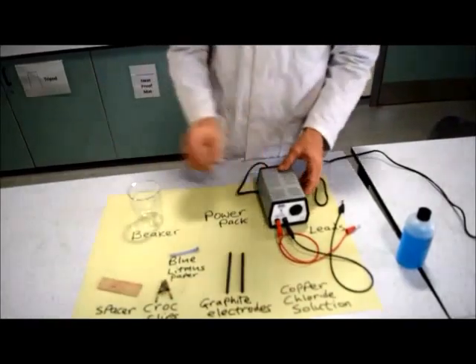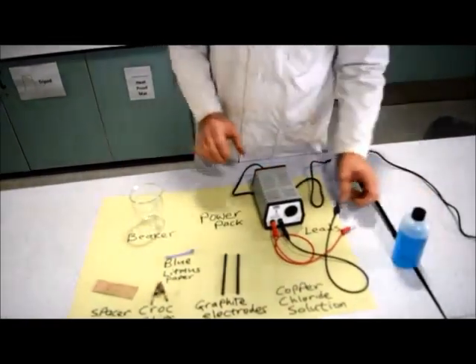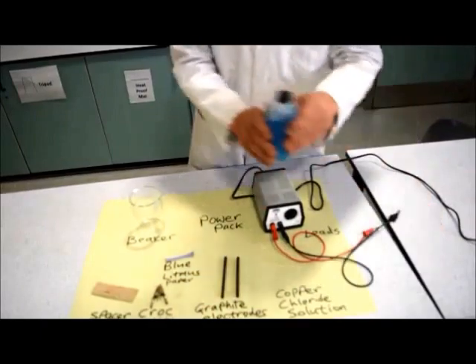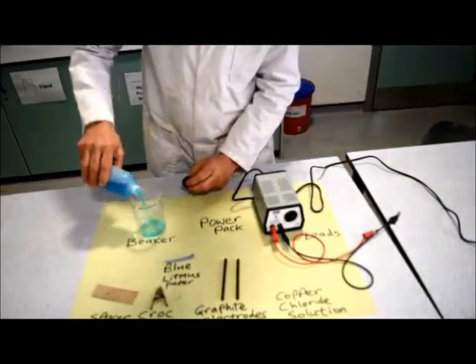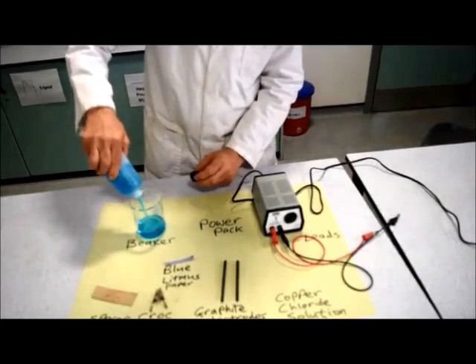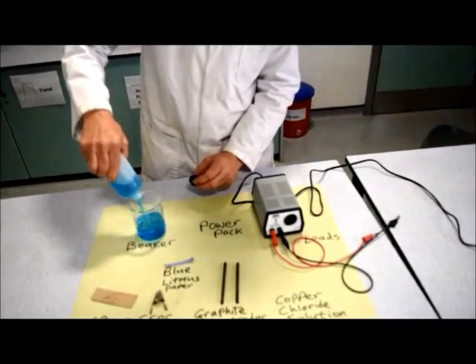Now I'm going to put this together. First of all, you pour your solution of copper chloride into a beaker. About halfway should be okay.